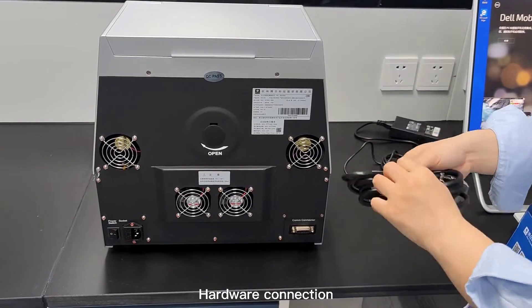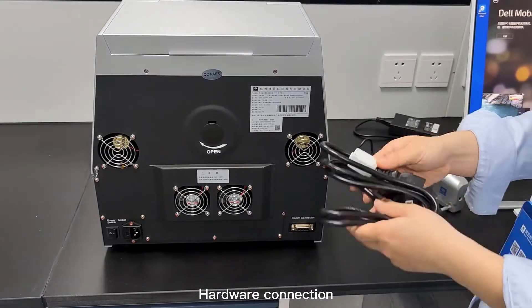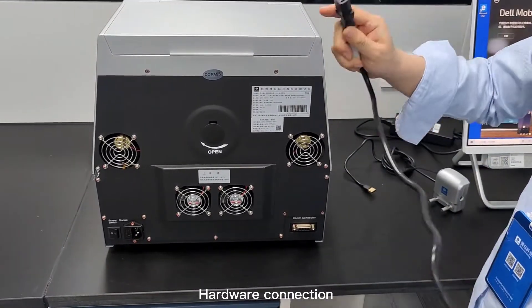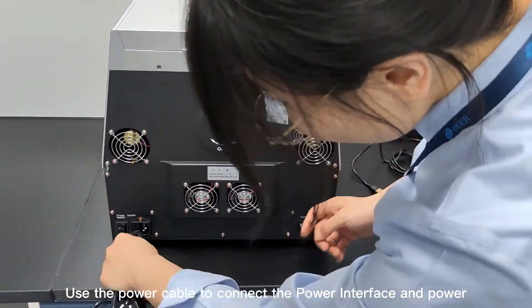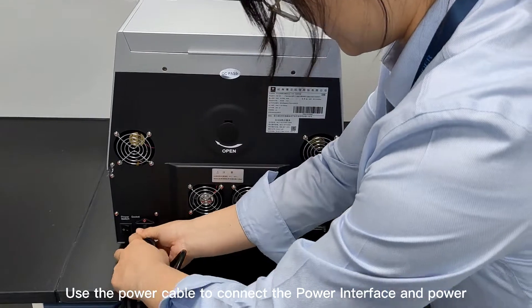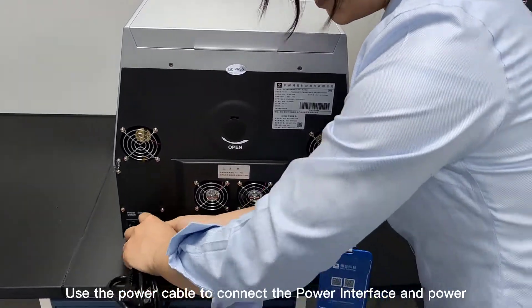Hardware connection. Use a power cable to connect the power interface and power.